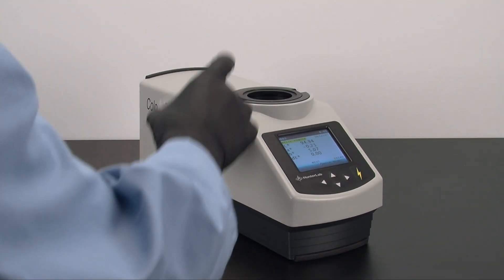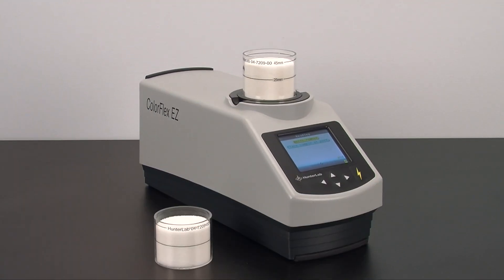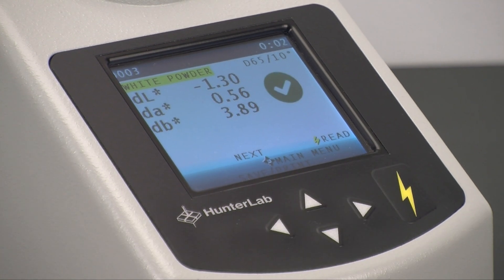Now let's measure the second sample against these values to see how two visually similar samples actually differ. Here are the values of the second sample, including its delta E, and the actual numeric differences between these samples.